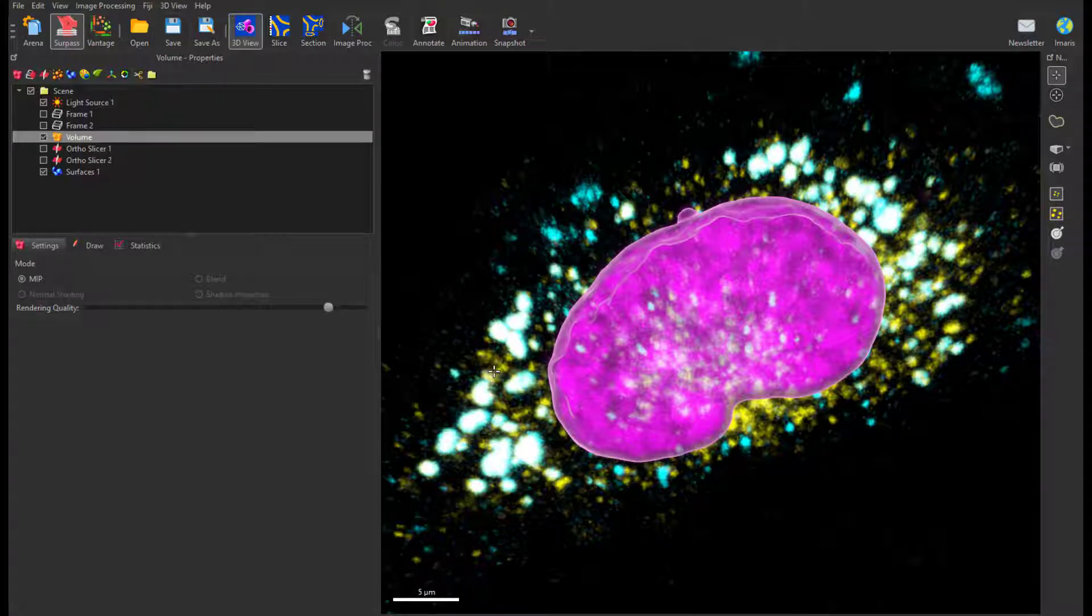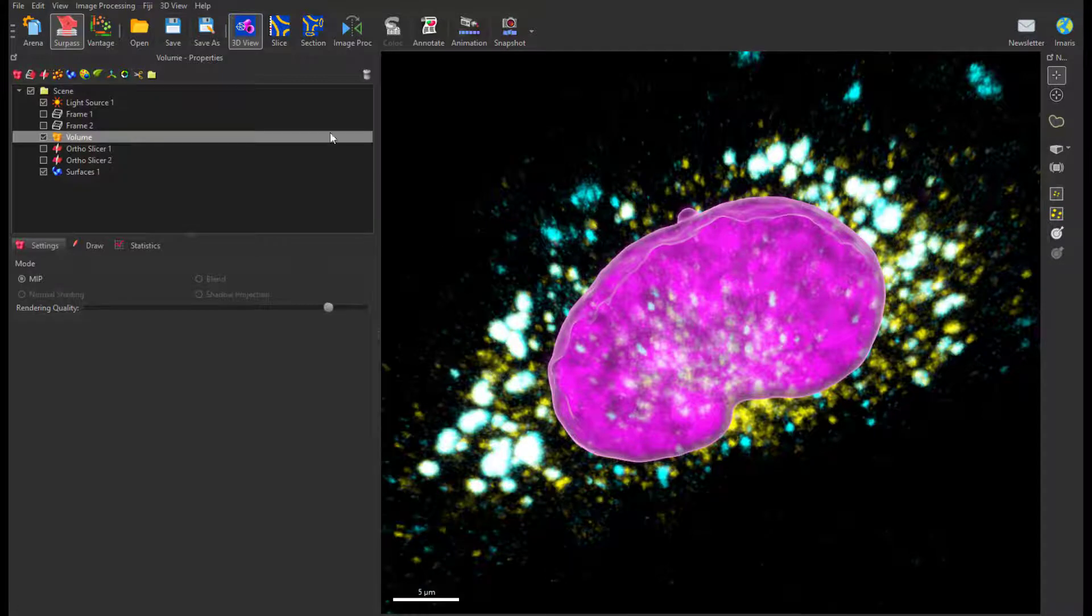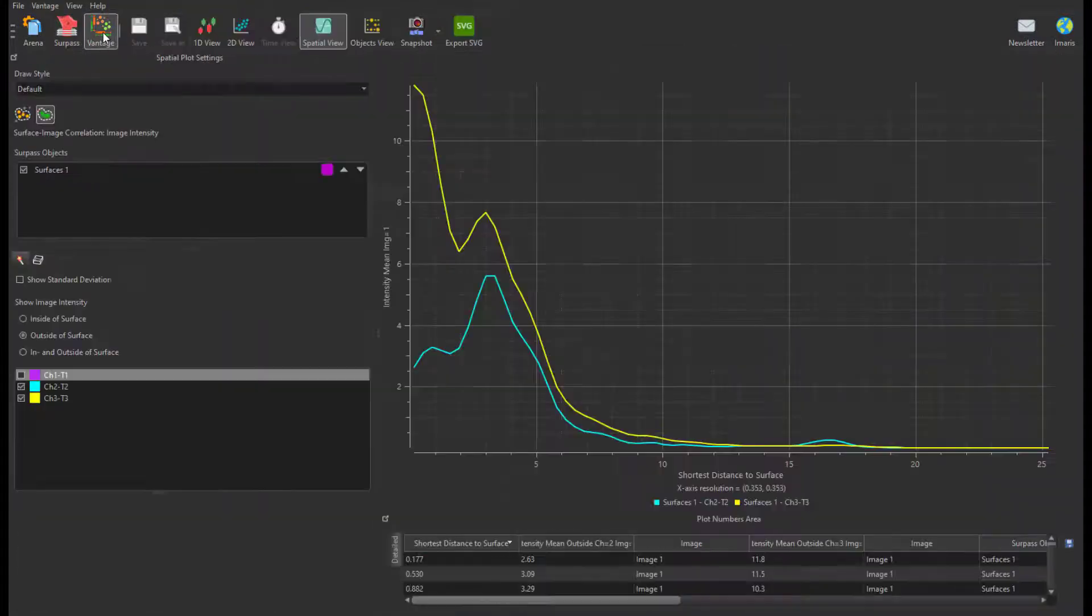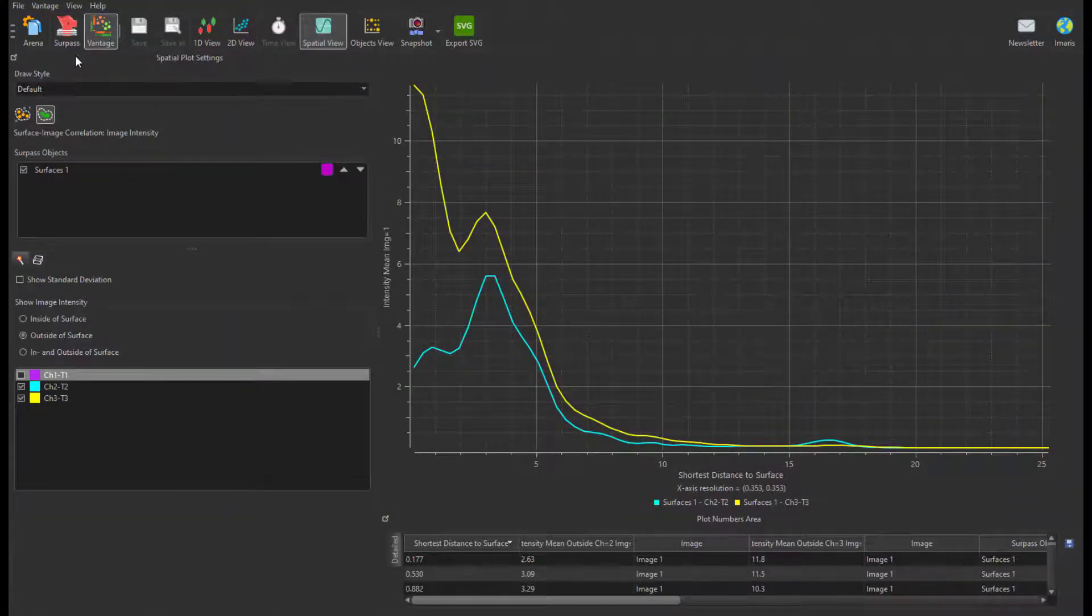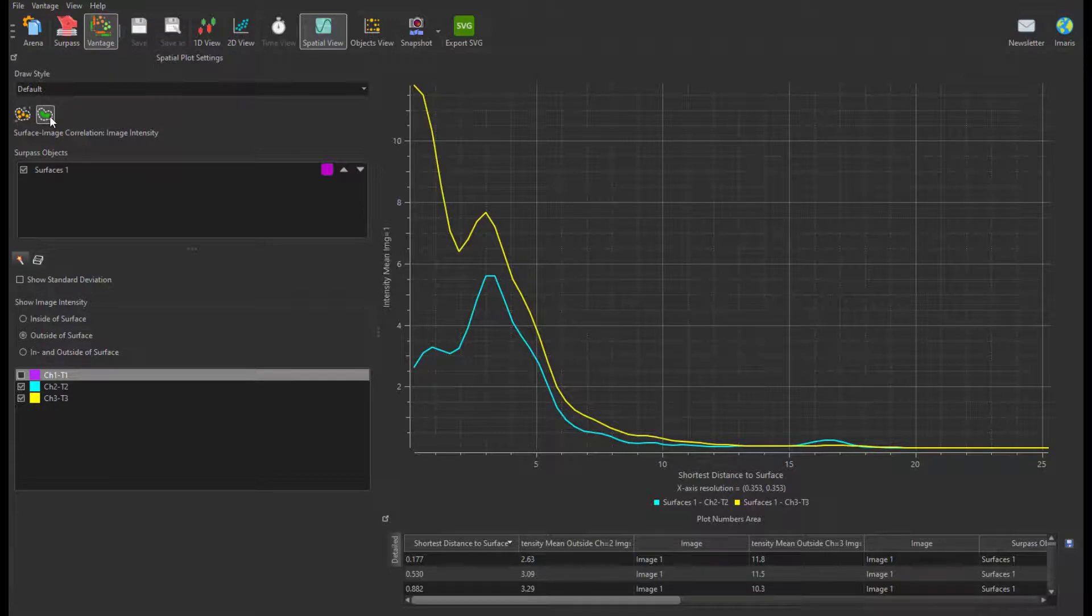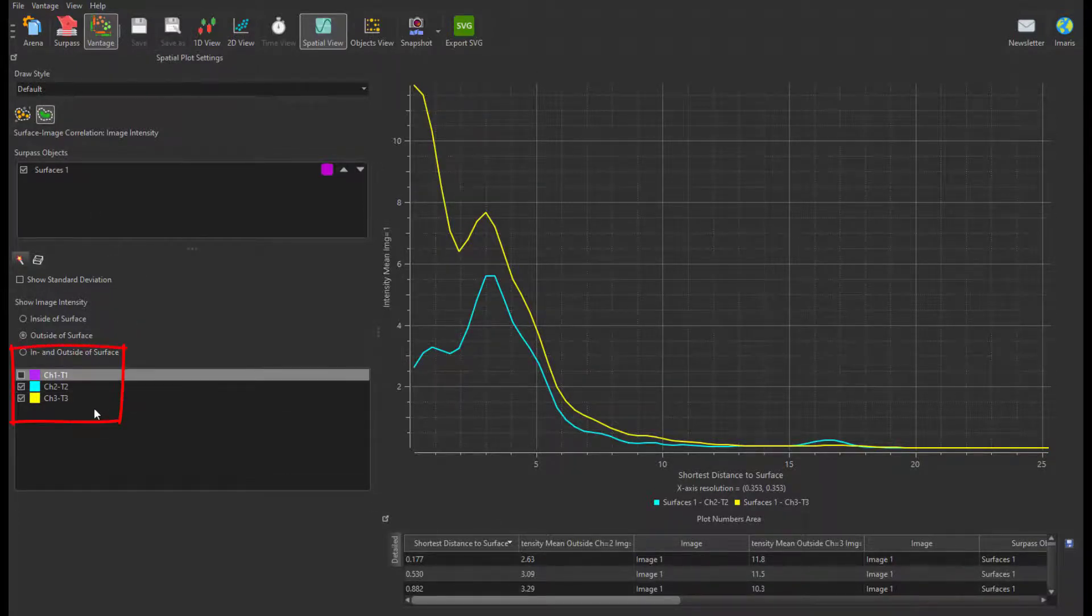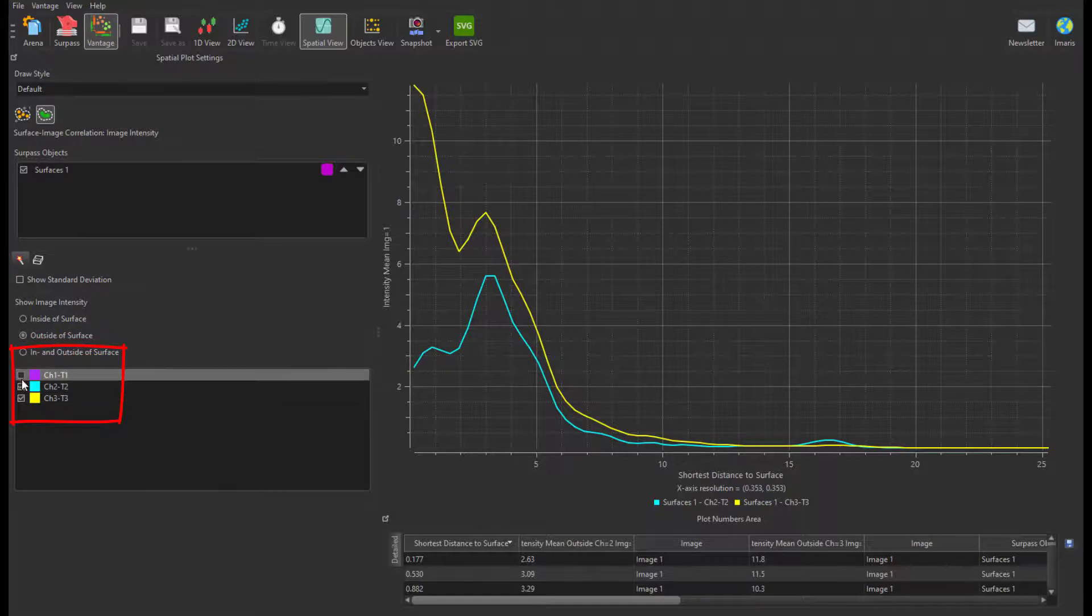When I switch back to Vantage Spatial view and select Surface Image Correlation, I can see the 3D mean intensity profiles of each channel around the nucleus surface.